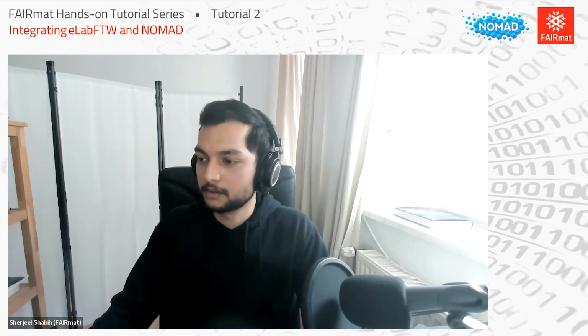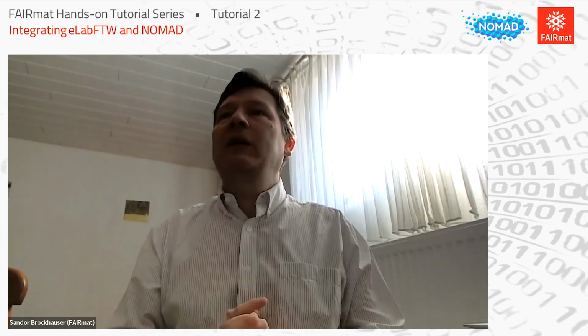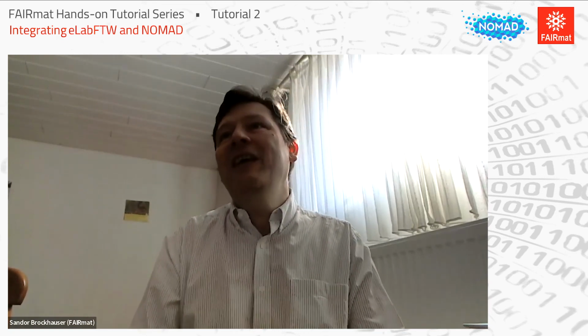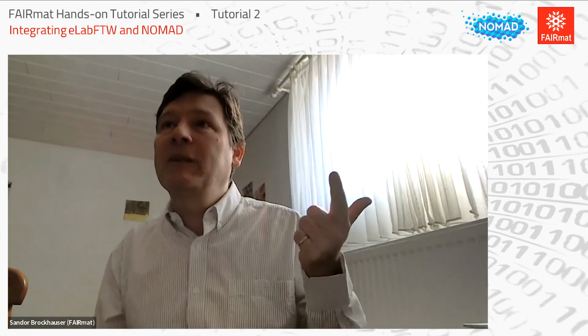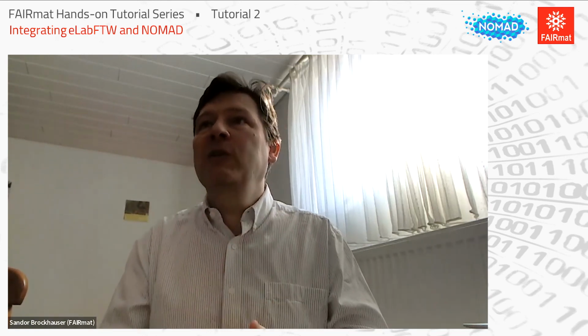But also maybe Marcus Scheidgen might be able to tell you a few more things on that. Indeed, that's what I wanted to support. The nice thing, and this is what FAIRmat is about, is really to manage your data in a FAIR way. And FAIR really means that you have to store the data in a way that it is understandable and interpretable, not only findable and accessible. So it's not enough just to store your data, but you also have to know what you stored and in which way.